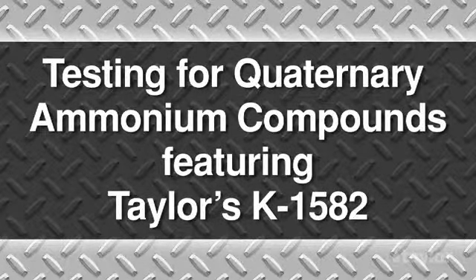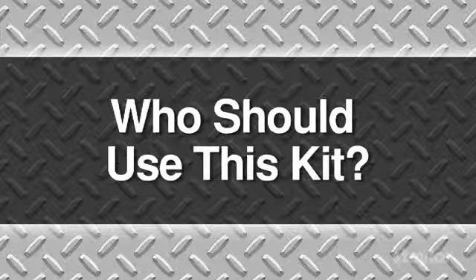Testing for quaternary ammonium compounds featuring Taylor's K-1582. Who should use this kit?